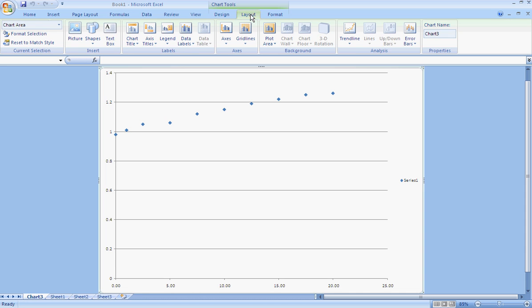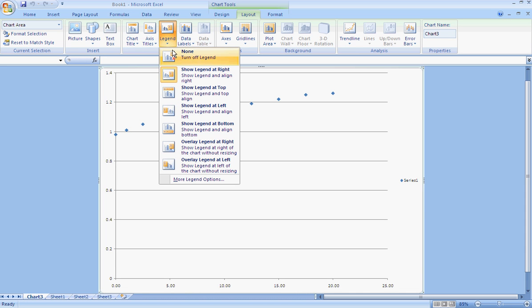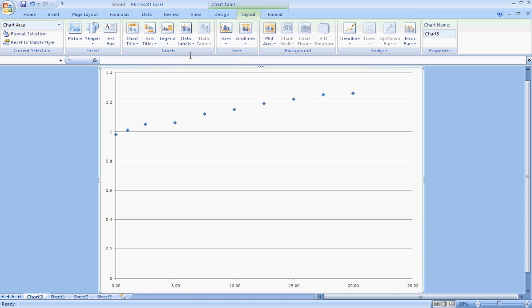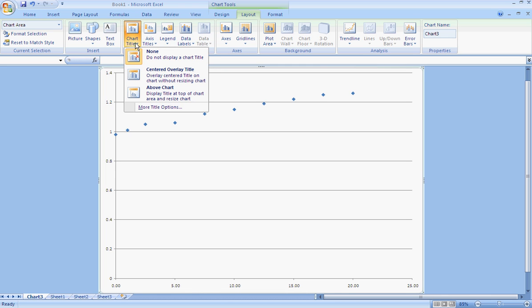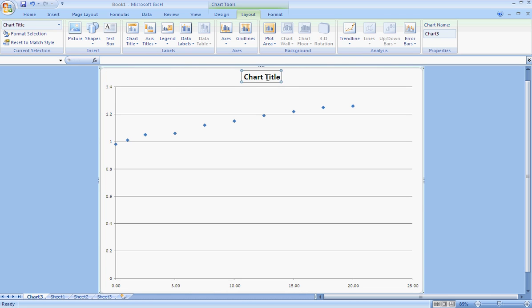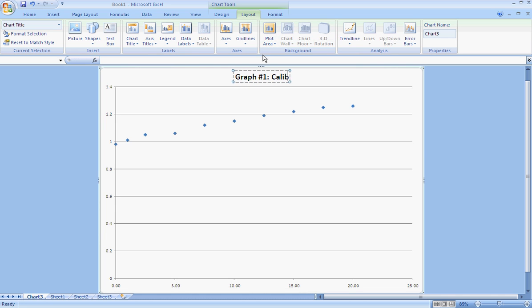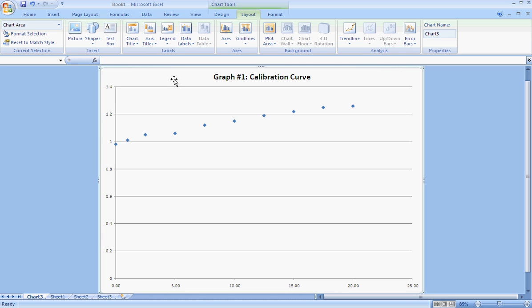So I'm going to come up here to Layout, and I don't need that legend, so I'm going to come up to Legend and turn that off. And I definitely need a chart title. So I'm going to come up here to Title and click Above Chart. This is my Graph #1, and it's a calibration curve. So that's a pretty appropriate title.